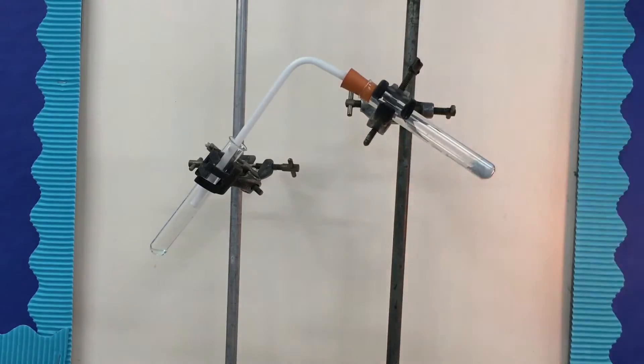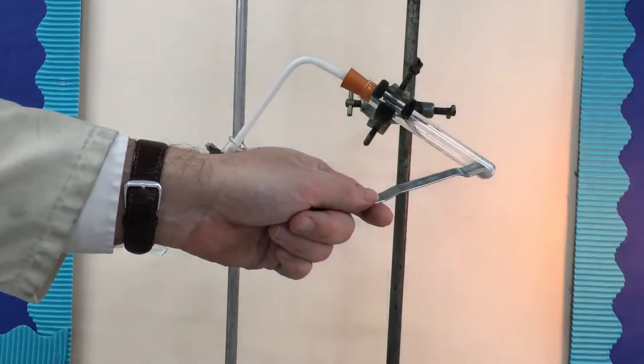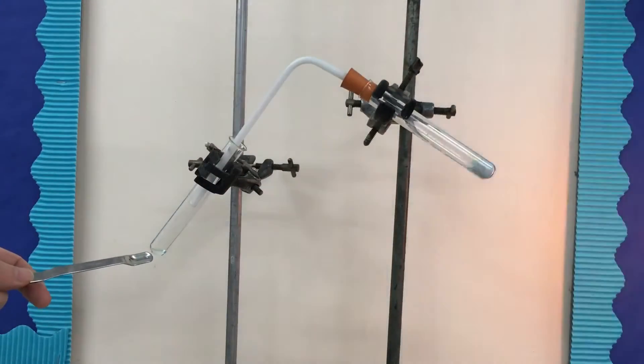So as we can see, we've heated the originally blue copper sulfate, the hydrated copper sulfate, CuSO4·5H2O, and it's become the white anhydrous copper sulfate and water, which we've collected in that tube there.